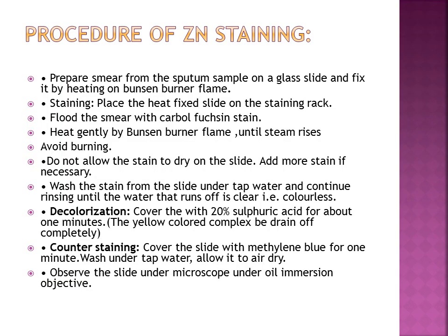The procedure of ZN staining: first prepare a smear from the sputum sample, then start the staining. First flood the smear with carbol-fuchsin, and then wait for 5 minutes, and in between gently heat the smear until steam is seen, and then wait for 5 minutes, then wash.